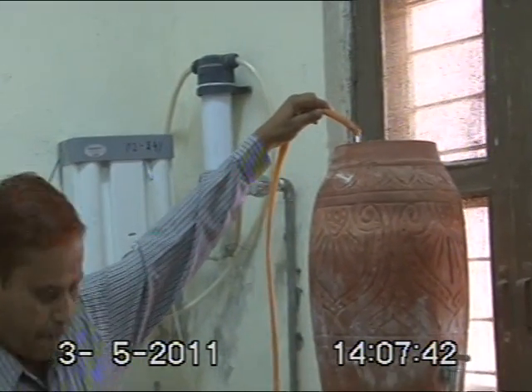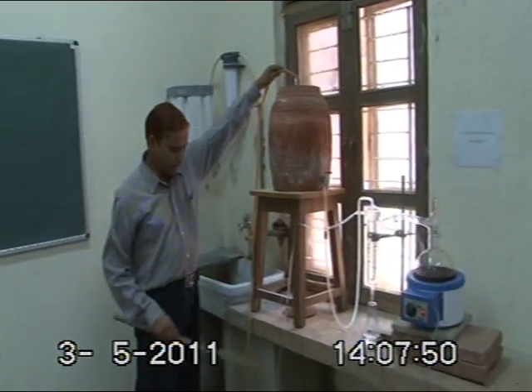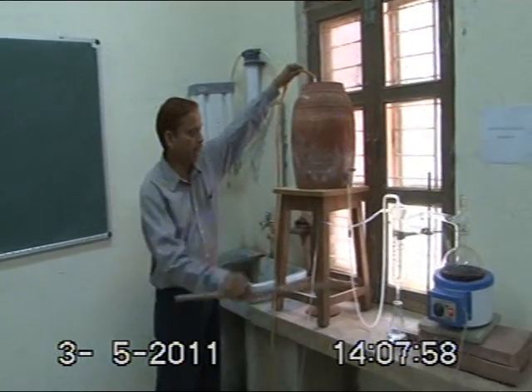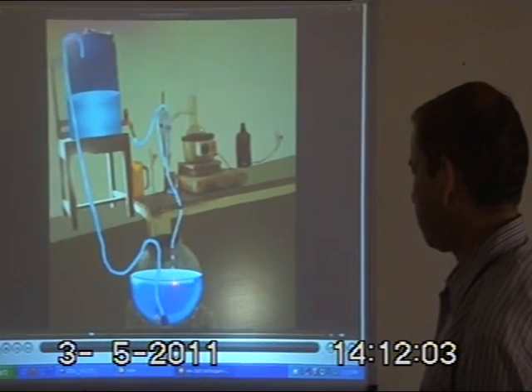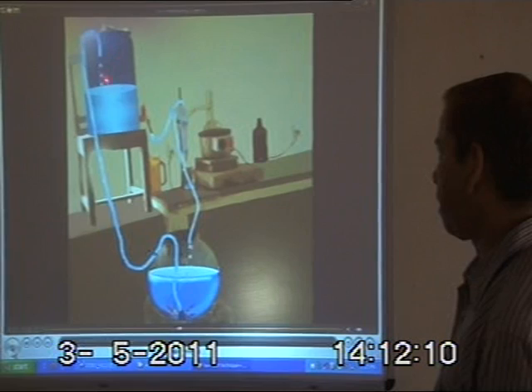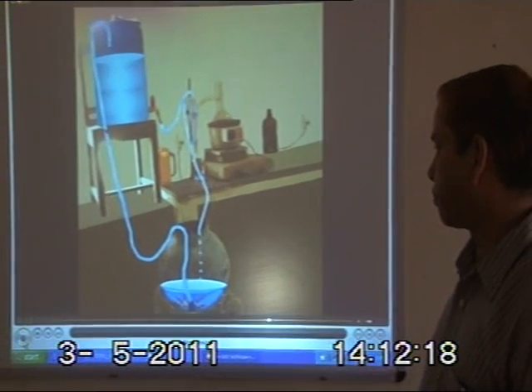You can see that once the water level rises in this container, the water collected from the outlet of the condenser unit is again filled into the tank. There is a submersible motor — once the water level touches here, the submersible motor switches on and the water is pumped to this overhead tank.